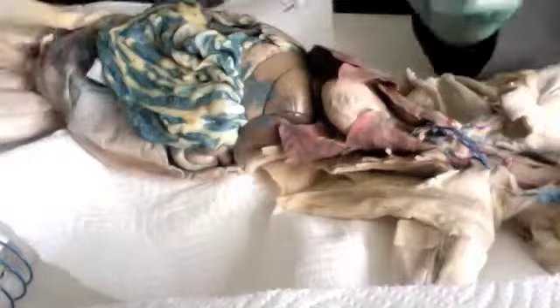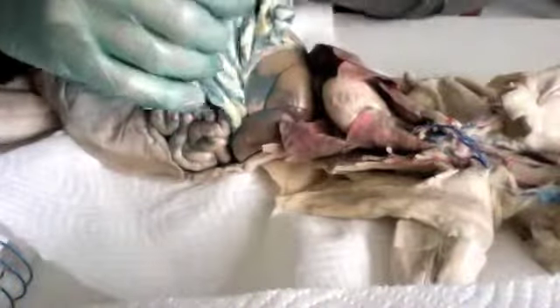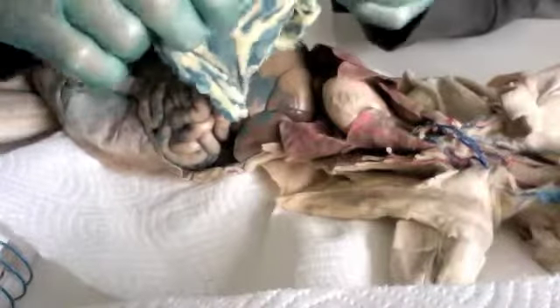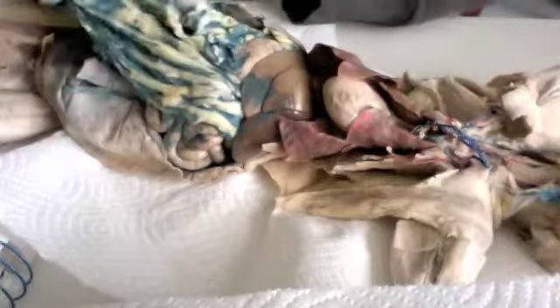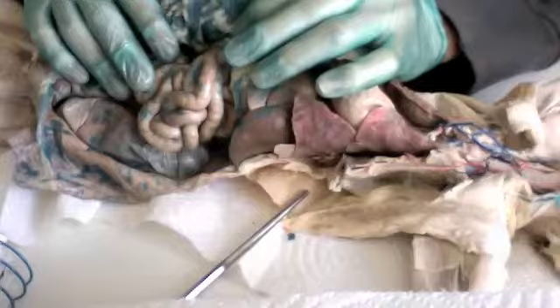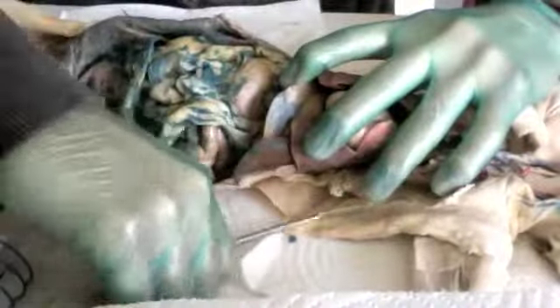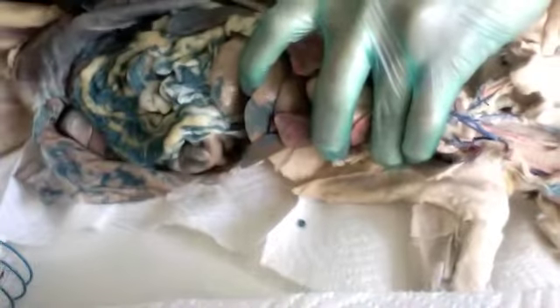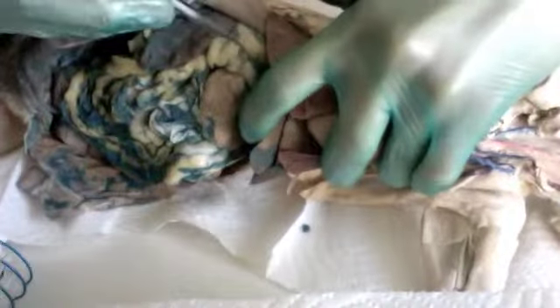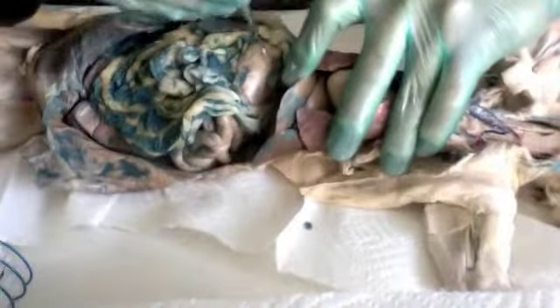And then the greater omentum is this web-like sheath here. This is the greater omentum. Okay, here we have the lesser omentum. That is located, if I lift the liver and move the diaphragm here, the lesser omentum is located here. Then we have the stomach, which is located here.